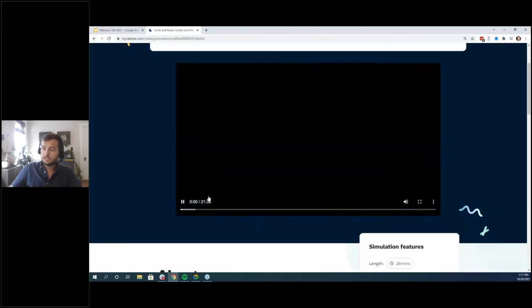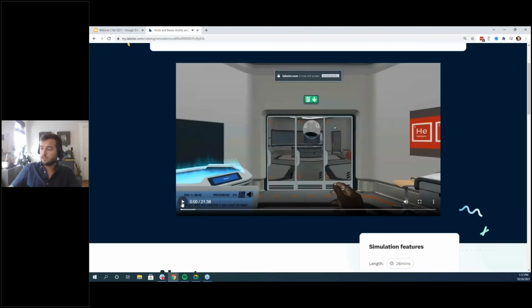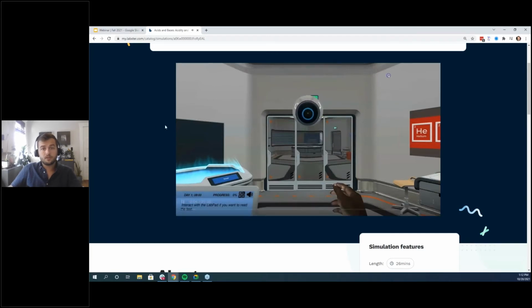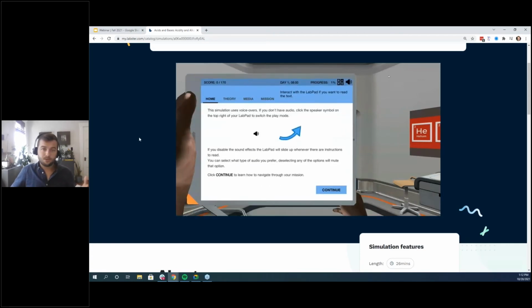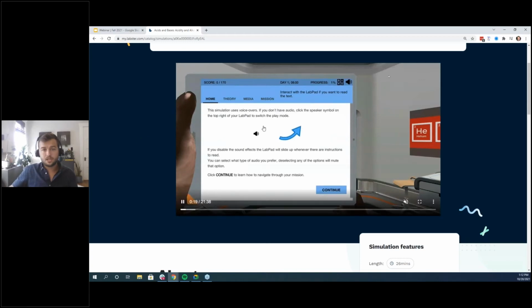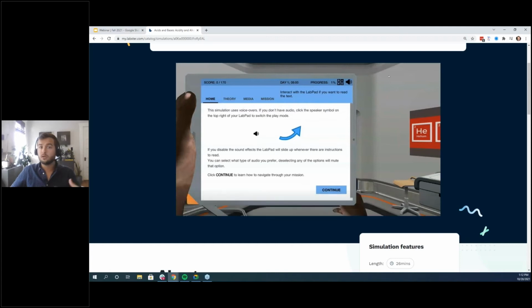Now, this page allows you to play a video so that you can see the lab rather than playing through it and having to click through each bit. This is Dr. One right here. She guides you through the entire simulation. You can also mute her if you would prefer to read rather than listening. Each time that you log into the simulations, it asks you, have you played through something before? Would you like a refresher on how to navigate our simulations?